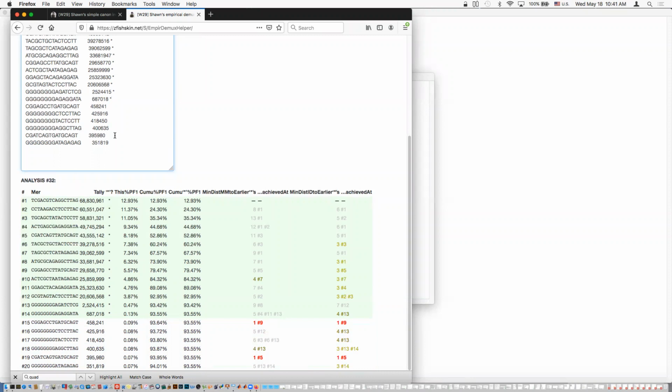But essentially, we'll do on I1 what our single end analysis was like. We'll do on I2 what our single analysis was like. Then we'll look at the pairings. Now that we've resolved the I1 and I2 separately, we'll see what the pairings are like. But you can work with this tool with the paired data like this. And actually, this looks like kind of a pair.